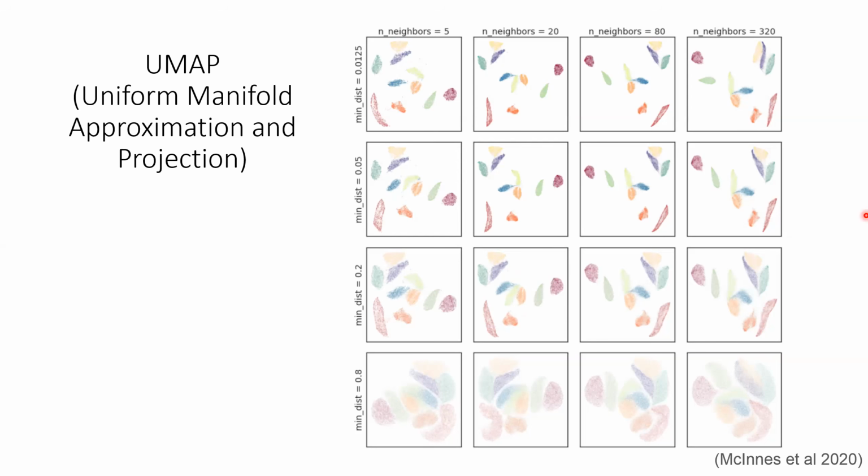And research in the Deeds lab has found that if you compare cell neighbors in high dimensional space on average, compared to this low dimensional projection, 98% of the neighborhood structure is totally different when you compare high dimensional neighborhoods to the neighborhoods found in t-SNE or UMAP spaces. So that is to say, t-SNE and UMAP almost completely distort the topological cell neighborhood structure.